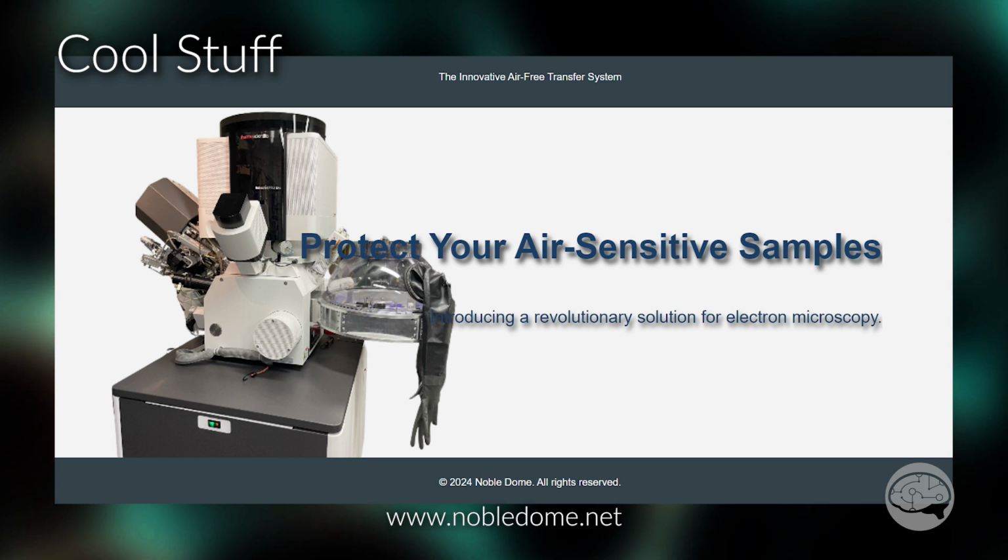Most of the EM manufacturers will have some sort of air protection transfer system for their own instruments, but most of them are fairly expensive. So if transferring samples in an air-free environment into an SEM or FIB is a problem you need to overcome, maybe you could take a look at this. I have an interview with them, and it is coming out soon.